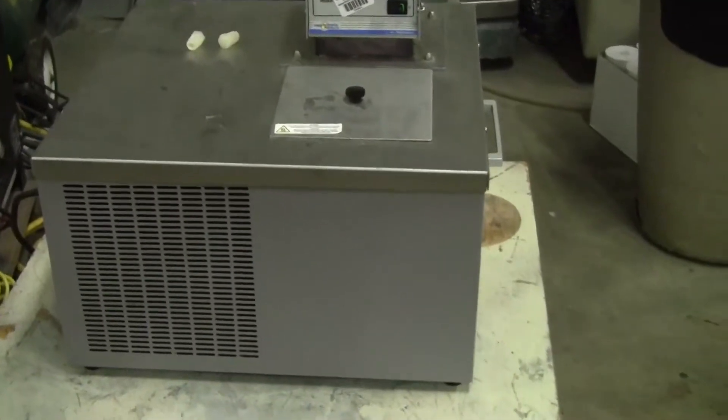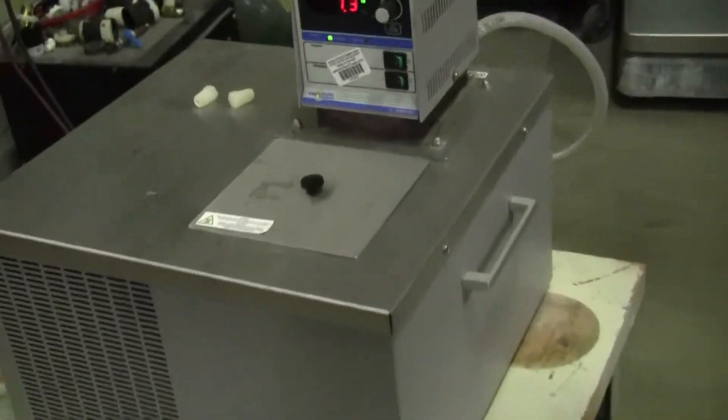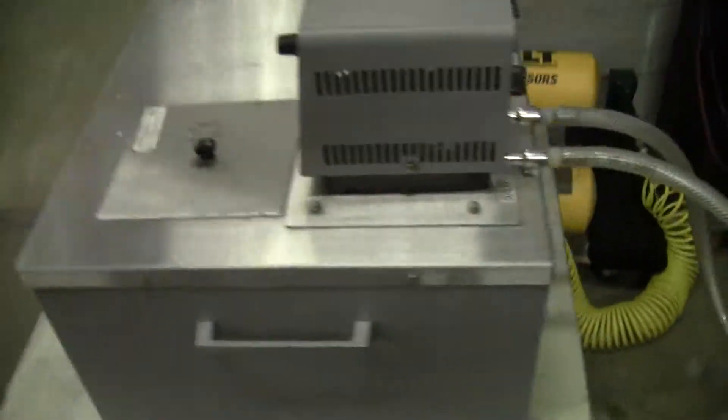Hi, this is Michael Natow from Hitech Trader. Today we're looking at the VWR PolyScience Recirculated Chiller.